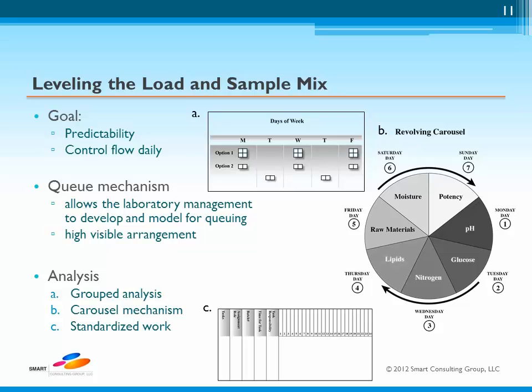Let's talk about standardized work. Standardized work is a contributing piece of the mechanism of success associated with the implementation of lean laboratory. Without a clean and mapped out program which details each individual sequence, the likelihood of success is limited. For each analysis performed by an analyst, a role needs to be defined so the individual understands what their contribution is to the operation and at what point it is necessary. Just like gears in a timepiece, if everything is synchronized properly, then the machine or the instrument will run as designed and to a desired level of proficiency.